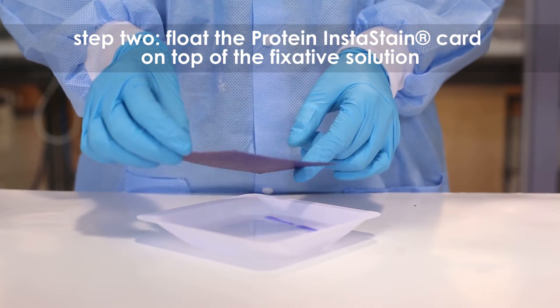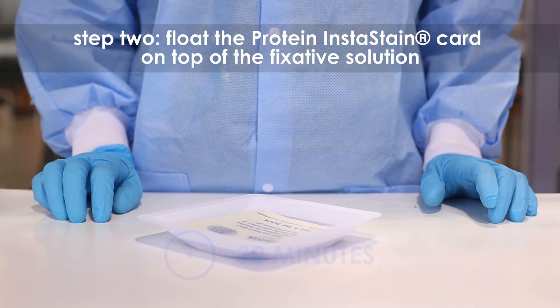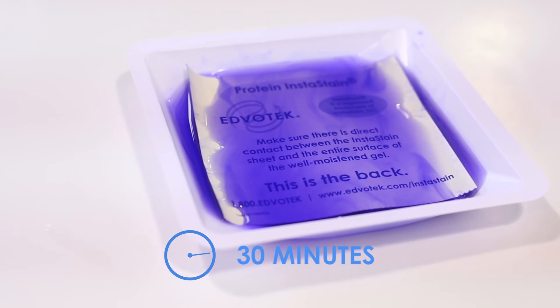Step 2. Gently float the protein instastain card on top of the fixative solution with the stain blue side facing toward the gel.